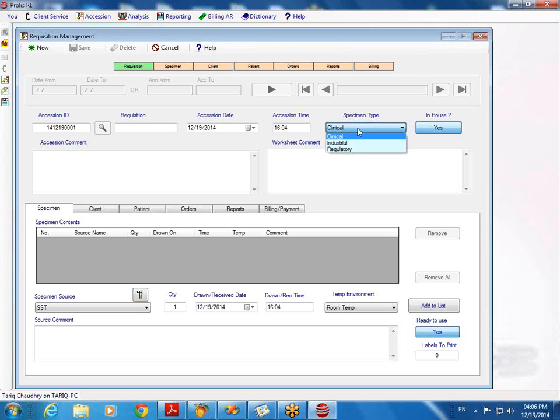Why do you want to customize this specimen type? So, for clinical research studies that we do, sometimes we have very different studies, and currently we have different accessioning IDs that correspond to the different studies. So it would be a different kind of template accessioning ID depending on the details of the actual sample. So that is not strictly just between clinical, industrial, and regulatory.